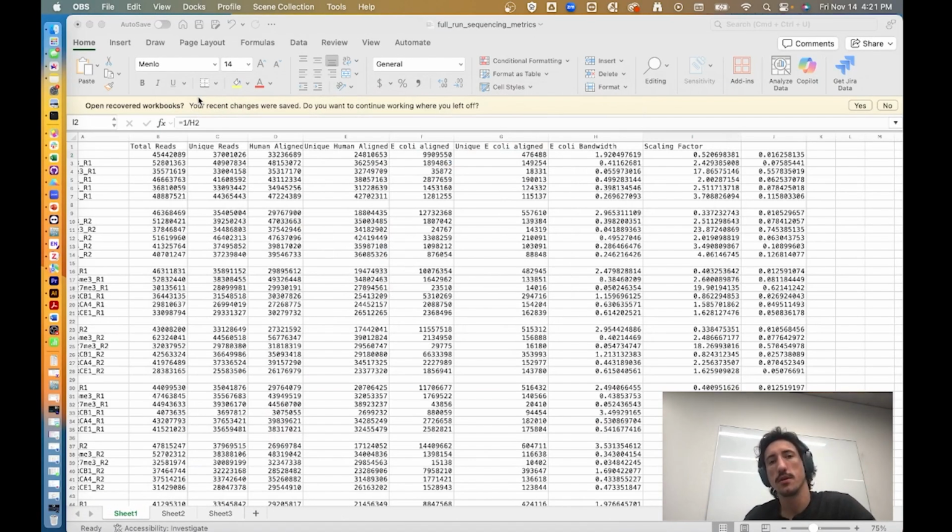Okay, so I'm going to try to explain this E. coli normalization with a metaphor to hopefully make it a little bit easier to understand. The issue with CUT&RUN is that you're not actually measuring biological differences across different samples based on just raw read counts. You're also taking into account technical differences between each sample, particularly the amount of starting input DNA.